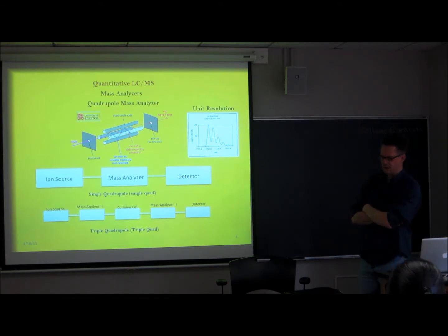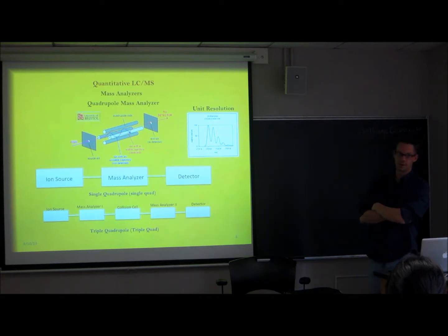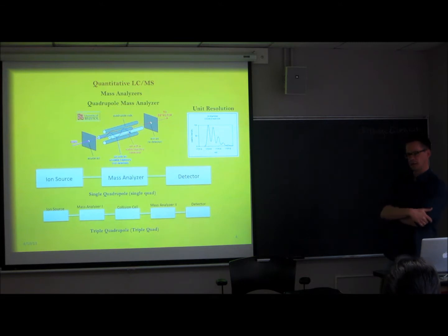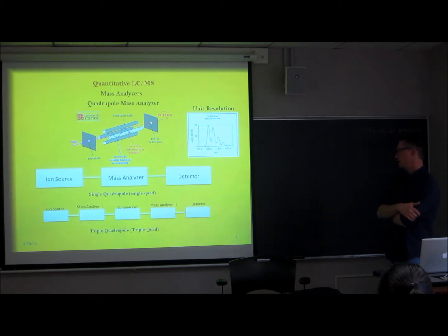Typically 90 to 95% of the LC-MS applications you're going to see doing quantitation is going to be electrospray ionization, which we talked about before, where you're taking a liquid flow off of the LC, desorbing those ions into the gas phase, and they're going into the mass analyzer to be separated and detected.